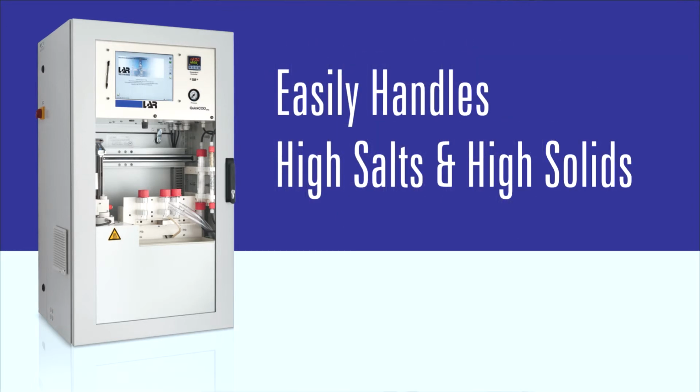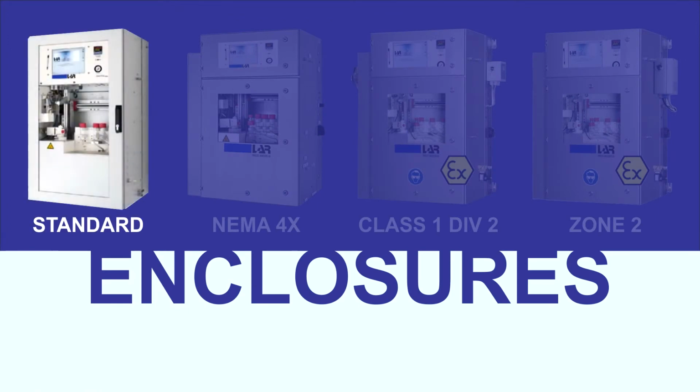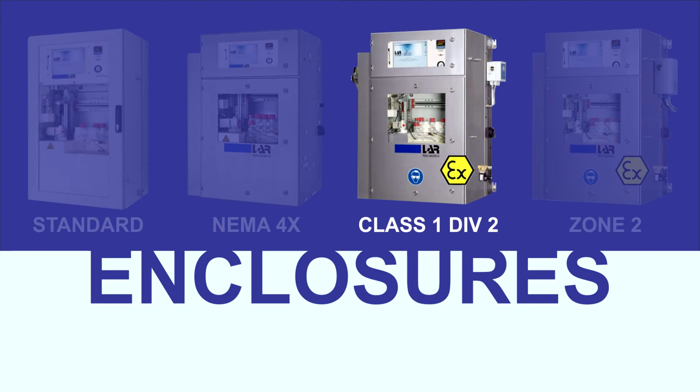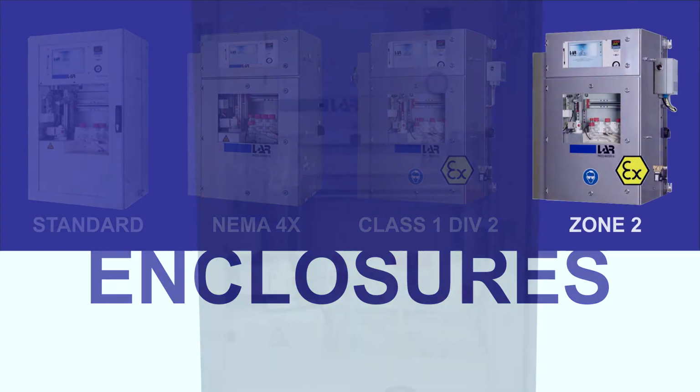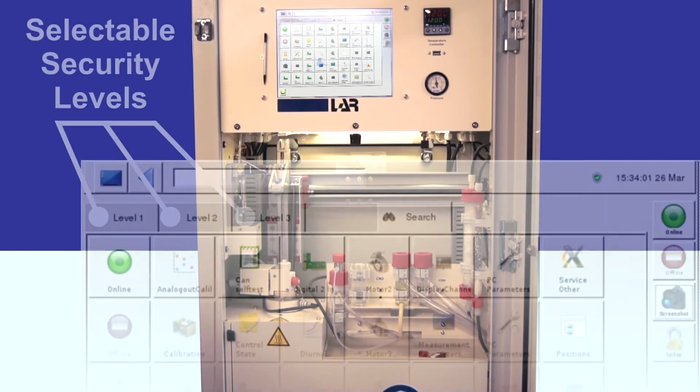The design easily handles high solids and high salts, and housings are available for industrial environments, including Class 1 Div 2 and Zone 2 enclosures. Ease of use and security are assured through icon-driven menus with 3 user-configurable security levels.